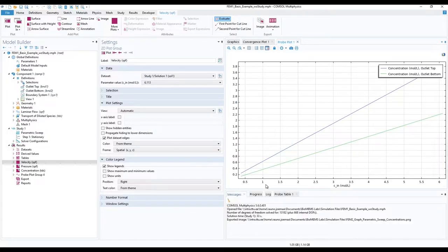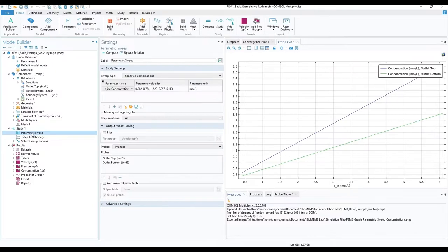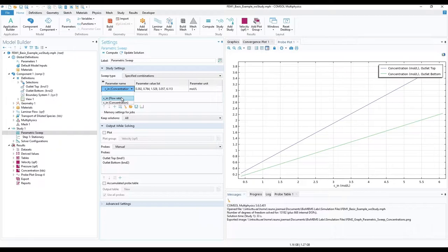Having seen what impact or lack thereof the changing input concentration had on our model, let us see what effects can be seen with changing flow velocity. We have the option to change the existing parameter. We could change it to velocity.